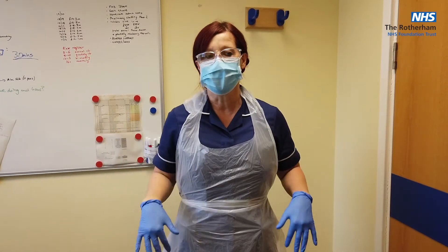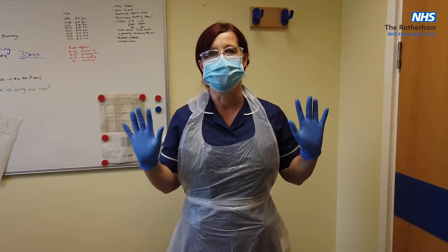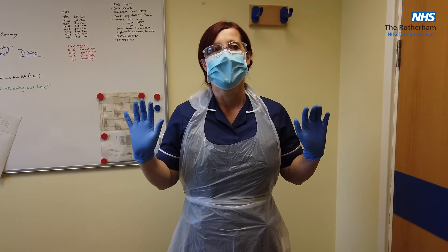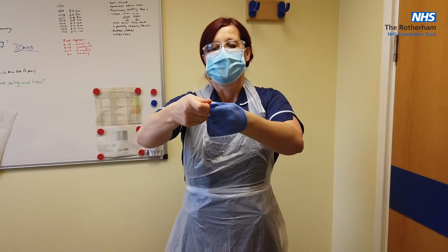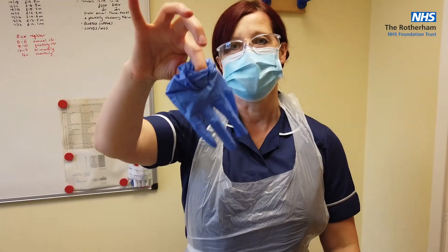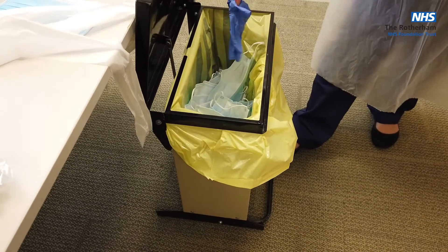The order in which you doff is to reduce the risk of cross-contamination. If I've donned all of my PPE, which order do you think contains the most potential contaminants from the care I've been delivering? That's right — gloves. To remove gloves, that instantly contains any potential contaminants and reduces the risk of cross-contamination. Dispose of them in your clinical waste stream as appropriate to your area.